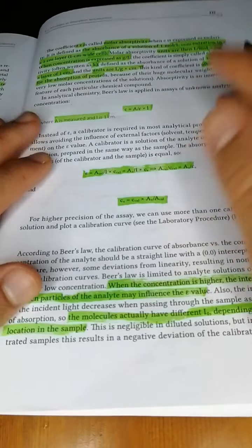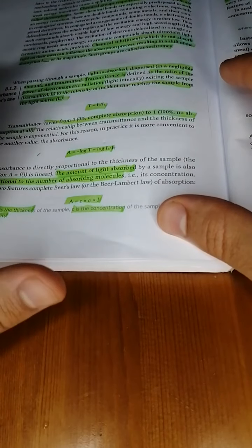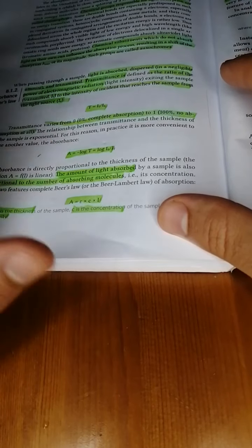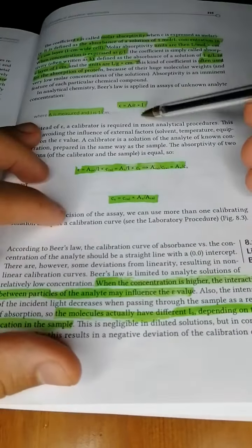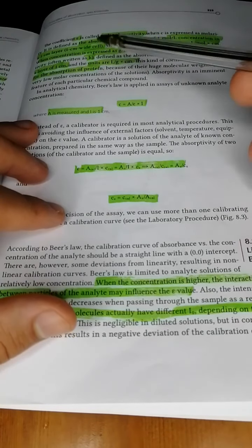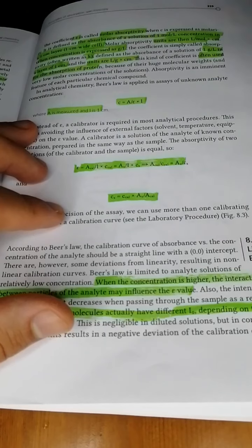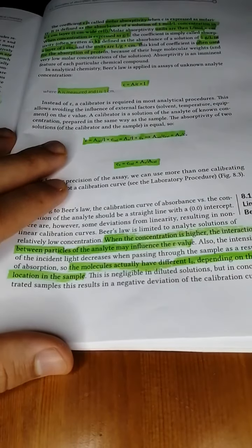All right, so here is a rearrangement of Beer's law. Remember this equation, by the way. Absorbance is absorptivity times concentration times width of the cell. So we're also going to have this rearrangement in order to figure out the concentration of a certain molecule in a solution.